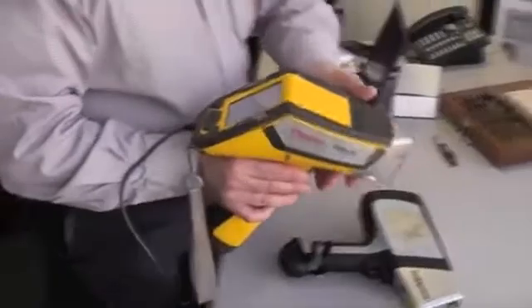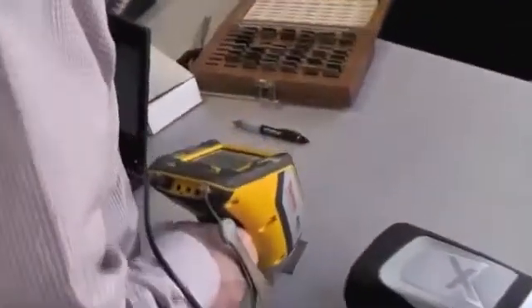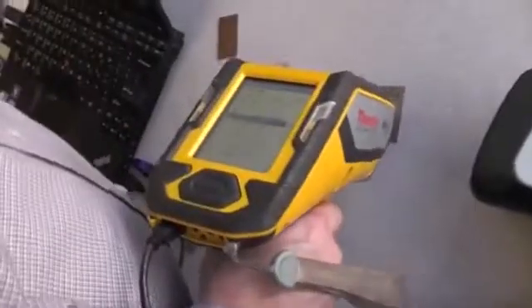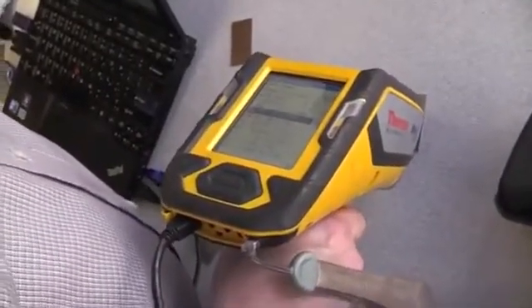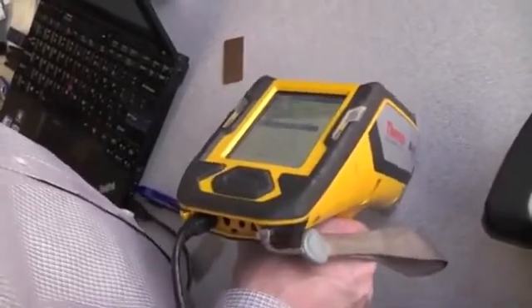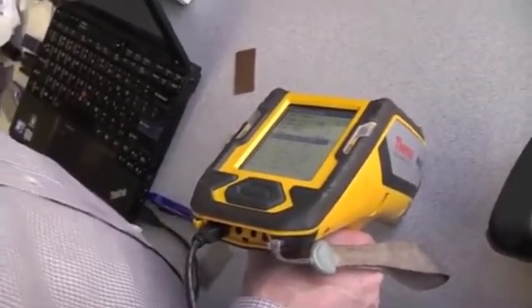The other thing I notice is when I use the Niton, there's no centerline on the top. They have an aiming line on the side, but not on the top, and actually the first couple times I did this, I wasn't lined up over the sample because the point kind of disappears when you get perpendicular to the ground, you can't really see it anymore.